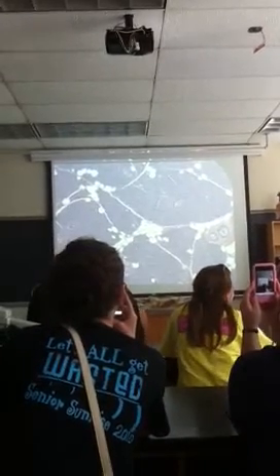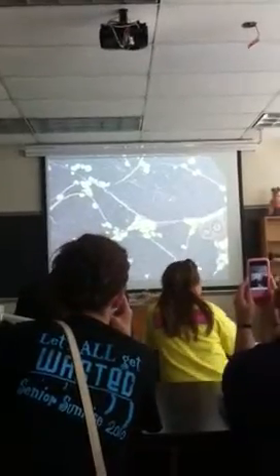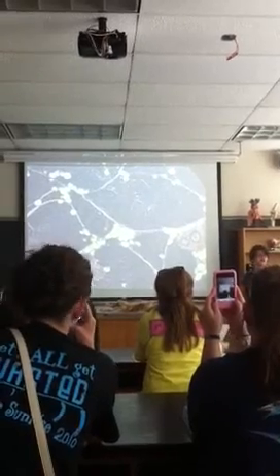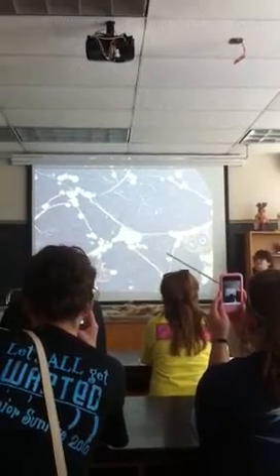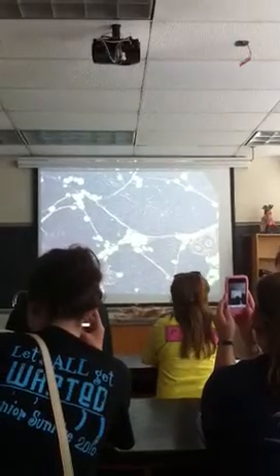First slide, it mentions the salivary glands. It lists 3 types, but we only really have to know one type. And this is the one type, and it's the first one on your list, which is a parotid salivary gland. Parotid are kind of in your cheeks, and they produce serous fluid, which is kind of liquidy, real watery. And that is why it stains purple, because the serous fluid stains purple in color.